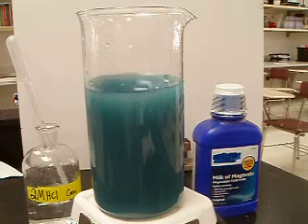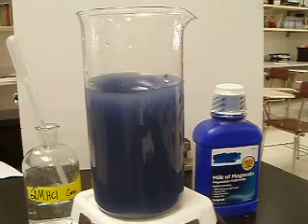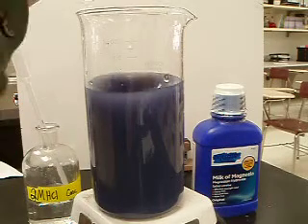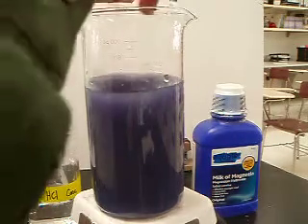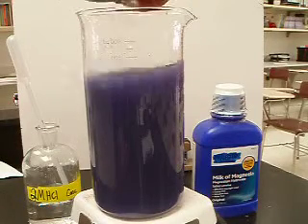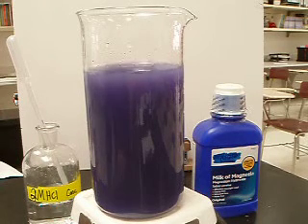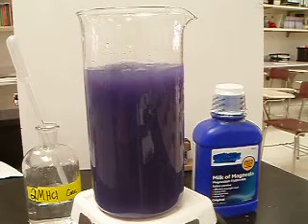So we can use the fact that we know how to change the rate of a reaction — such as dropping a few ice cubes in. We can cool the reaction down to slow it down. It will also slow the dissolution, the dissolving, of milk of magnesia. So we'll give that a moment to get cold.